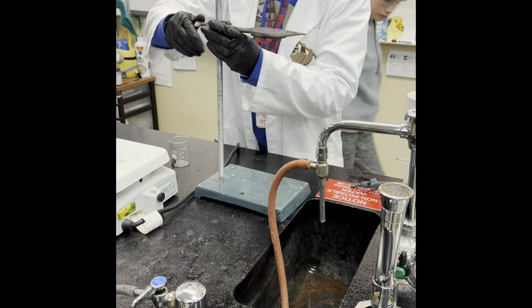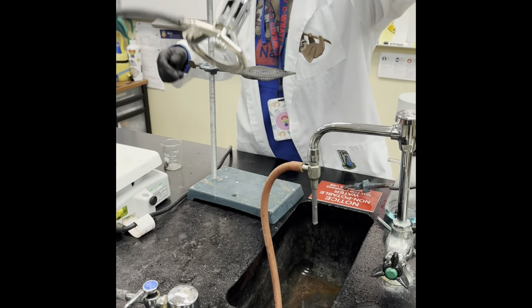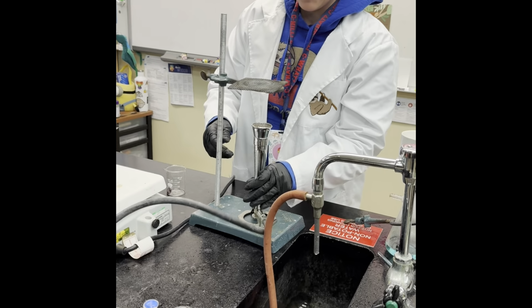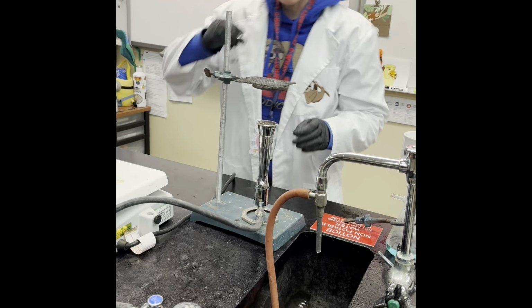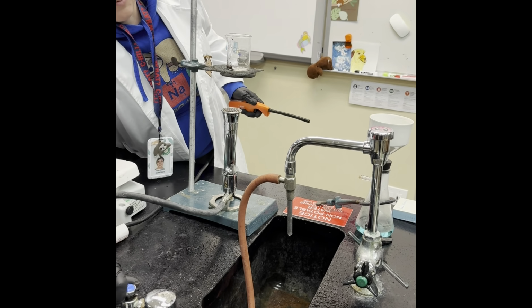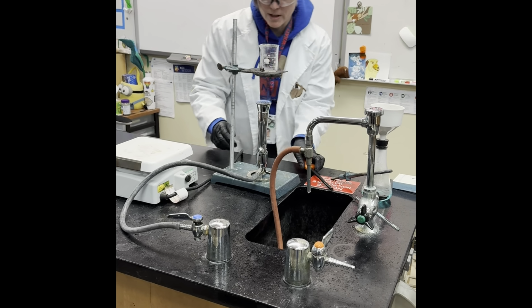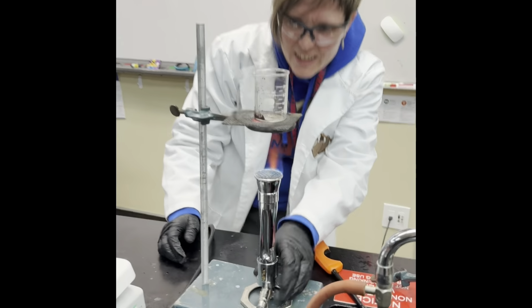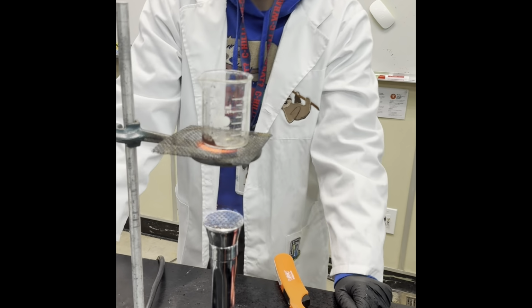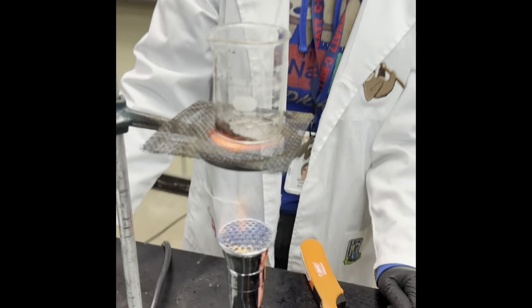Okay, so now we got our stage 2 set up, and I need my Bunsen burner because I'm just gonna speed this along. All right, so you could totally do this on the hot plate too, but this will go faster. I'm trying to just dry out that water. You can see this gets super hot because we have metal out there, so you can see it get red.